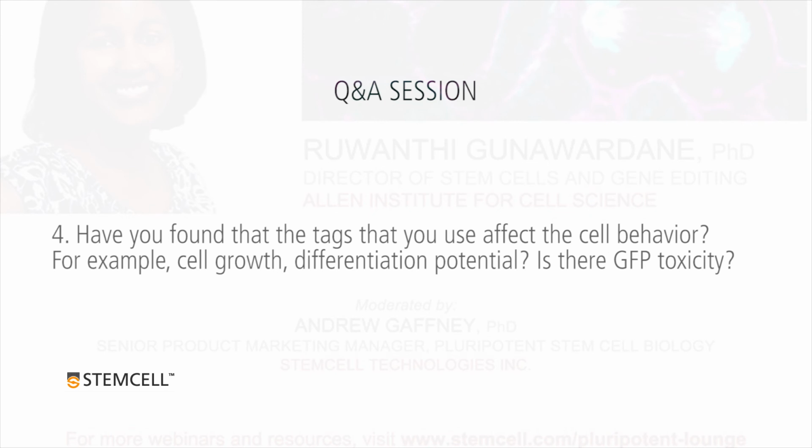Okay, thank you. The next question we had asked a few times, so I'm going to combine it into one. Have you found that the tag that you use affects cell behavior? For example, cell growth, differentiation potential, and that's linked in with, is there GFP toxicity? Yes, no, we have not, interestingly.